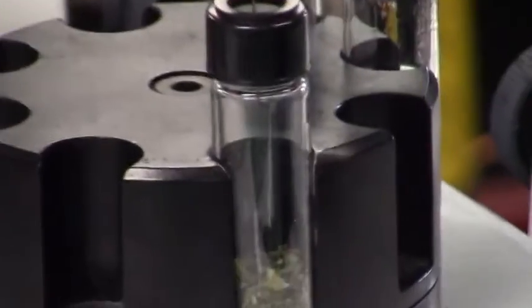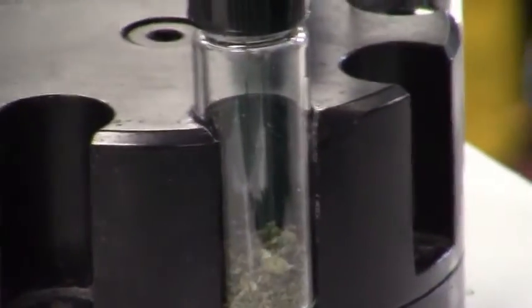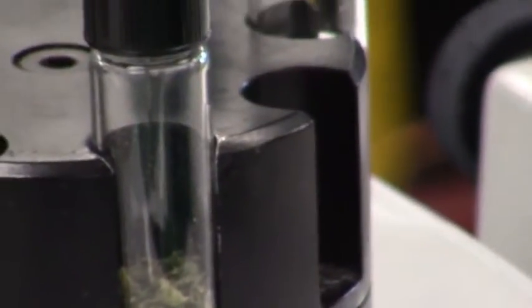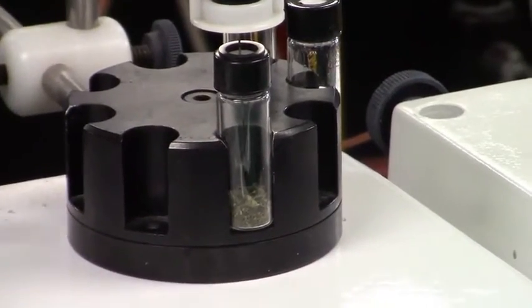So I give it a couple more twists, and now I'm going to press the top of the plunger and expose the fiber. It's down inside the vial. I twisted it into the notch to hold it in place, and now I'm going to let that extraction go for about 10 minutes, and then we're going to desorb it into our GC-MS.